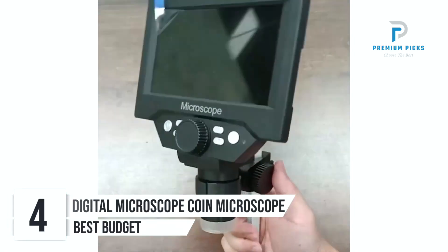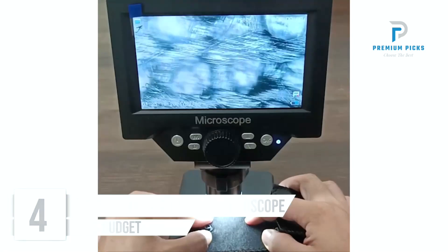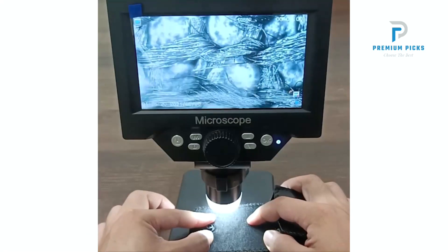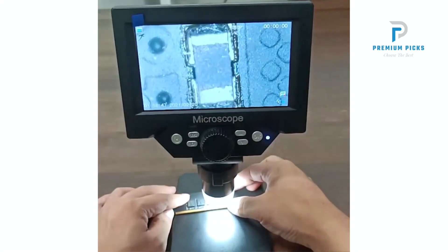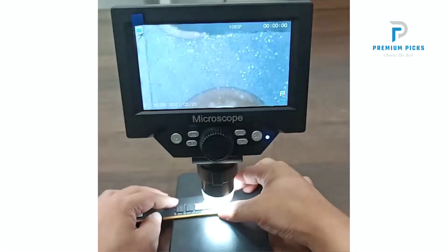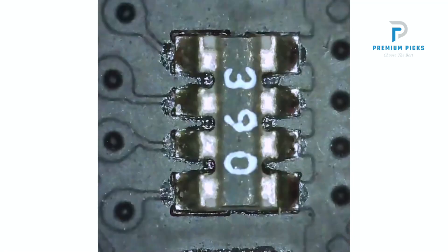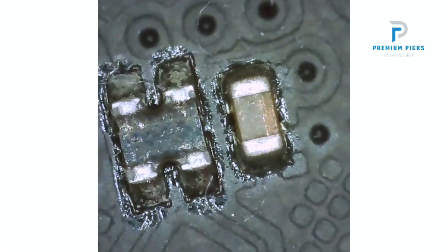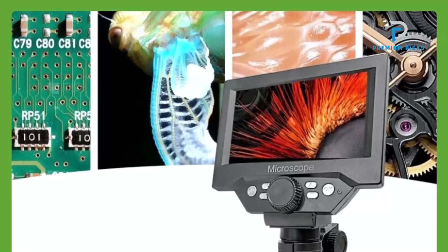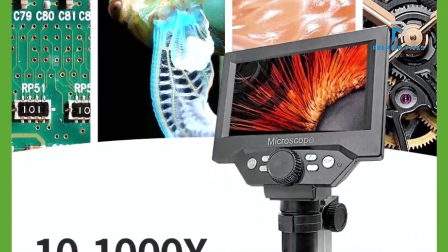Number 4: LCD Digital Microscope Coin Microscope. Introducing the 5.5-inch LCD Digital Microscope Coin Microscope, a powerful tool designed to provide high-definition images and unparalleled magnification for all your observation needs. Experience crystal-clear imaging with the 1080p HD camera chip, delivering stunning pictures and videos with unparalleled clarity and detail.